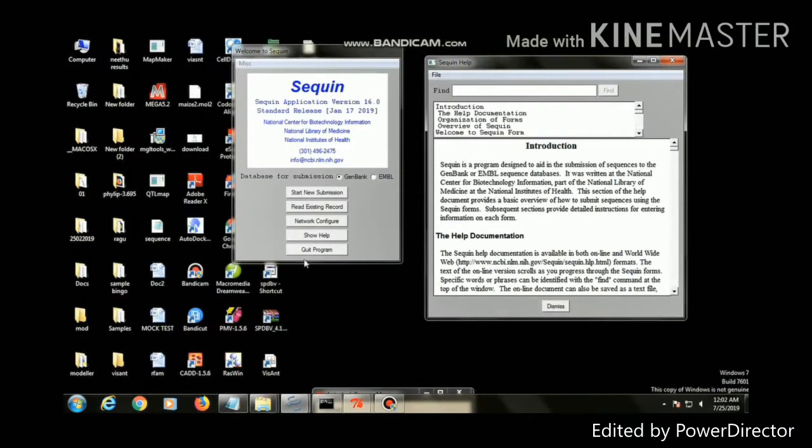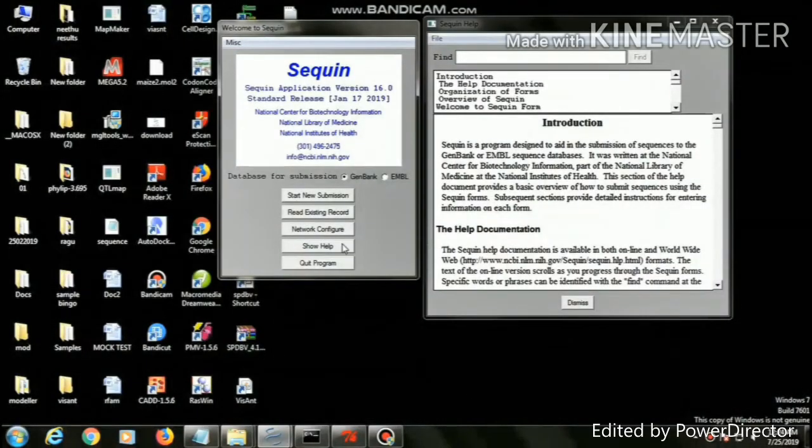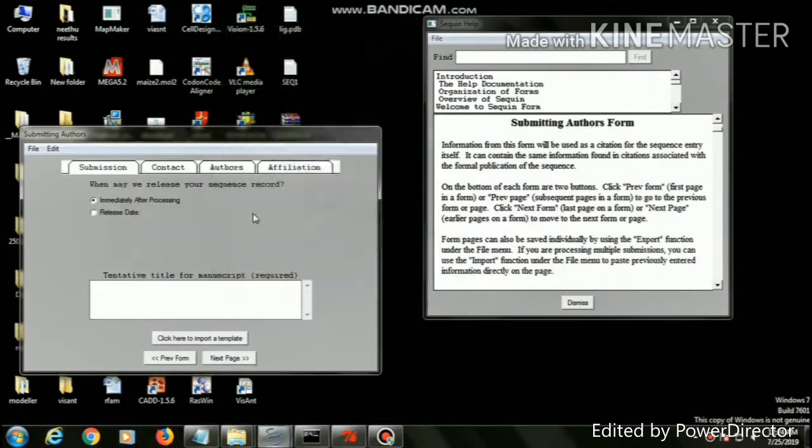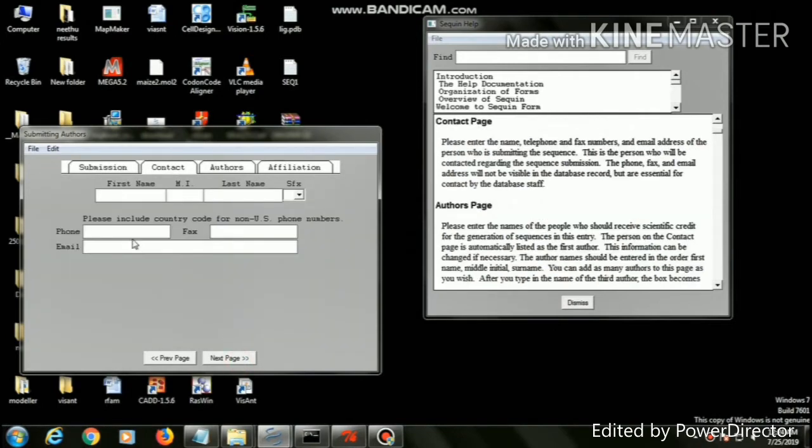Open the Sequin tool, then click start new submission. It will ask for a tentative title for manuscript. Give the tentative title and click next page.